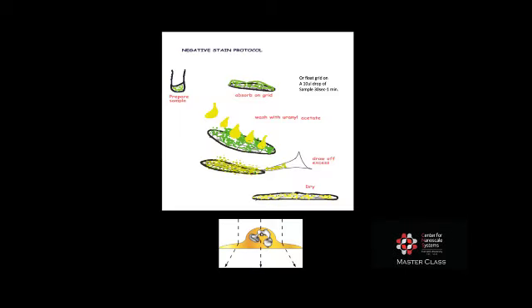The protocol is quite simple and easy to master. The most difficult step, before you ever prepare your sample for electron microscopy, is preparing your sample from the cells that you're working with. After you have a clean sample prepared, you simply absorb that onto the grid, or you can float the grid upside down on a 10 microliter drop of the sample for 30 seconds to a minute. You wash this, pick this up with fine forceps, wash it with 5 drops of your uranyl acetate, draw off the excess UA, and let the sample air dry.